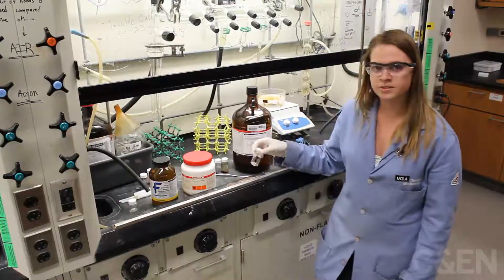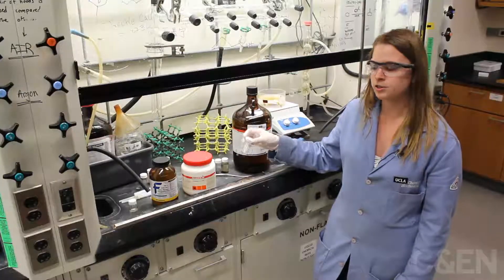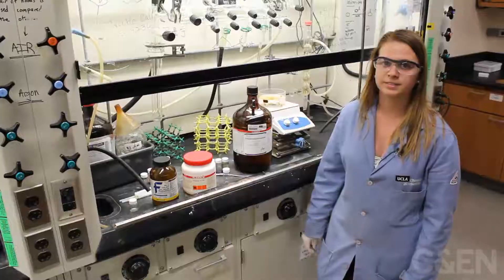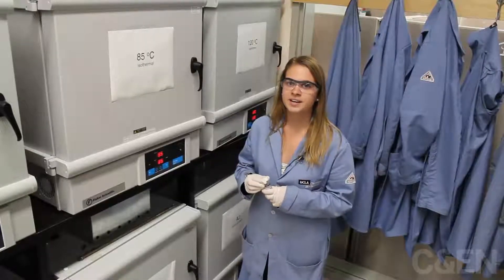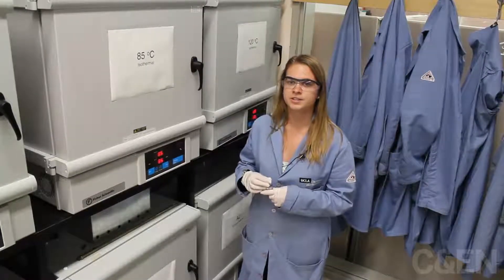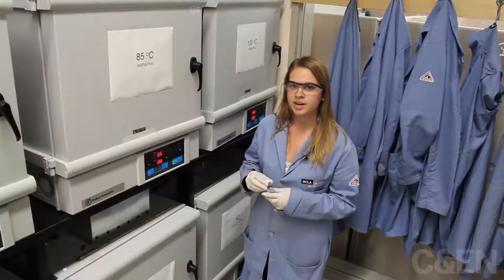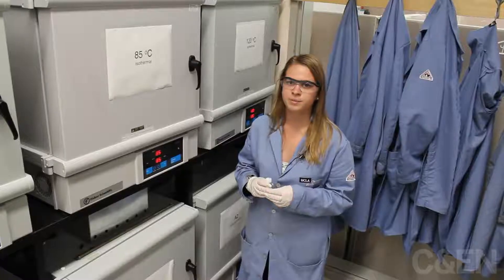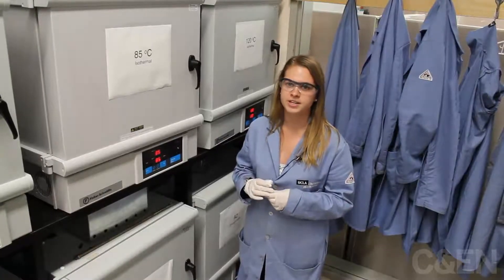After mixing our organic and inorganic pieces in a vial and adding the solvent, we swirl to make sure the mixture is homogeneous. Then we're ready to put it in the oven — a 60 to 120 degree oven — for anywhere from several hours to several days.